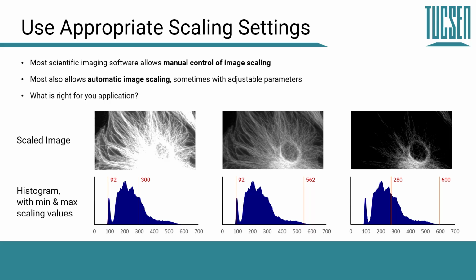In many cases, as I've mentioned, the automatic image scaling might be what you need, but it's important to realize that these options are available to us to explore what's going on in our image and hone our image scaling in on exactly what we're interested in.